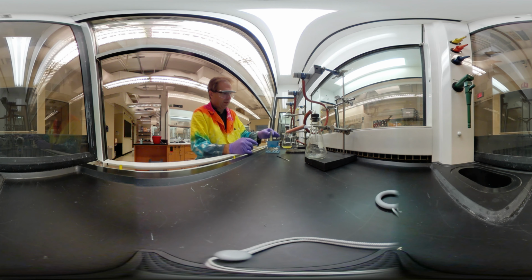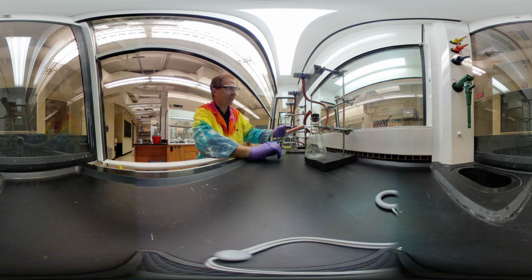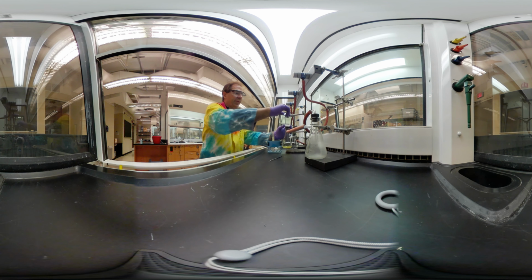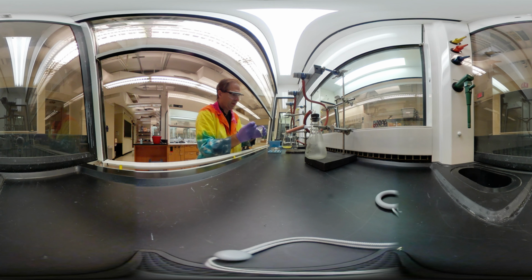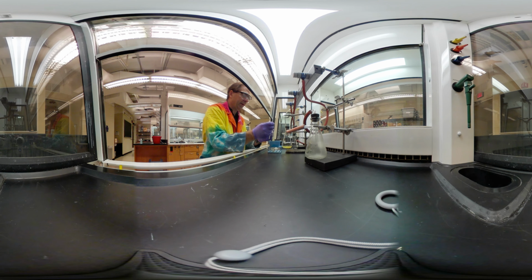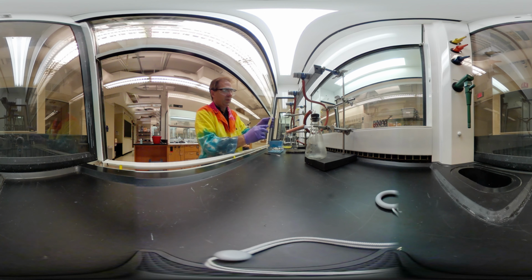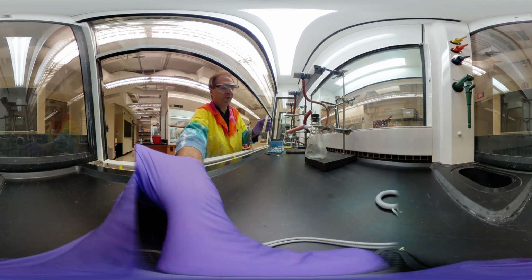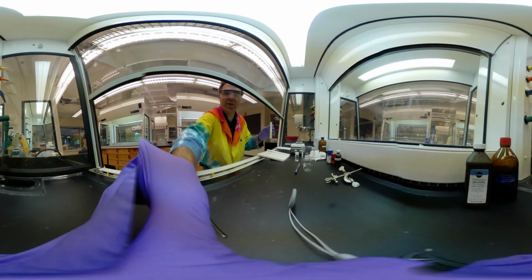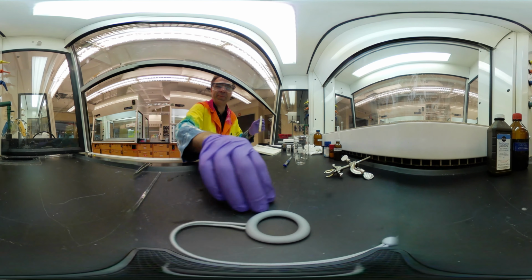Okay. Now we're going to put this back into here. Yep. We can break the seal. There we go. We got a good vacuum there. And here is our, ooh, look, we got a lot of this product. That's good. All right, we're going to put that back in. All right, there we go. So now, hopefully this is not too dizzying, but we're going to go back across the lab over to the hood that we're doing our reactions in.